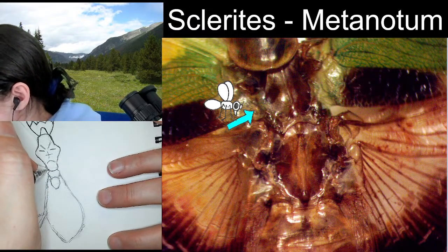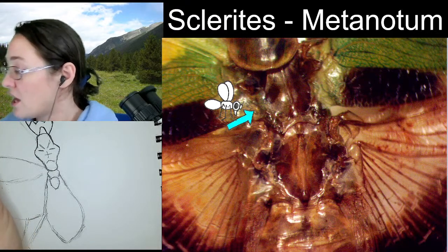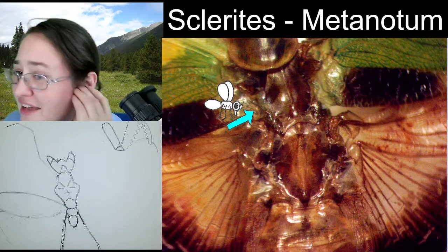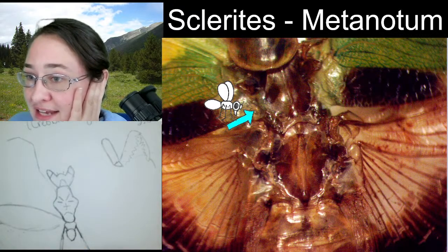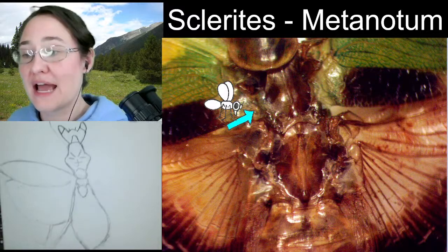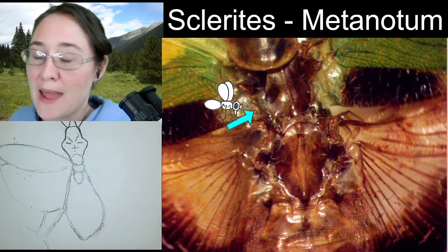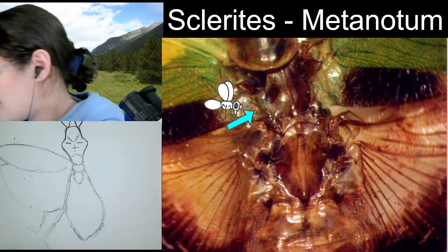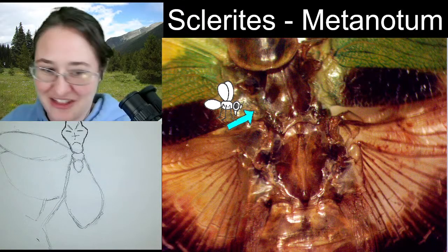So as a general insect rule, pro means first, meso means second, meta means third. So you can use those beginnings of the words to modify a lot of things. Like, if on this front leg, I could say the procoxa is expanded, because that would be the coxa, but I want to say it's specifically the first one, not the second or the third one. So you can say that, you can say metafemur or mesotibia. And when you know kind of how to put the words together, then you'll understand scientists when scientists just start putting words together like that.